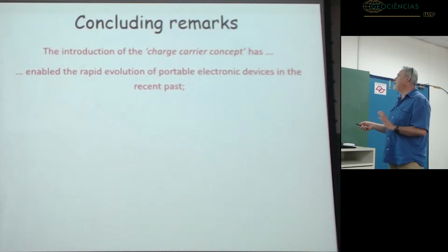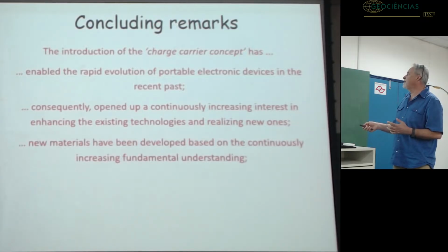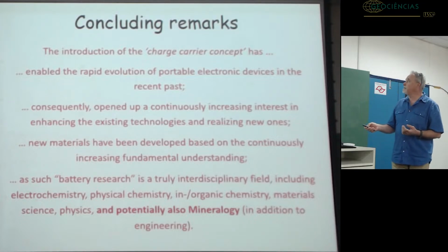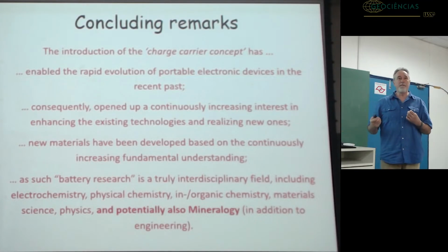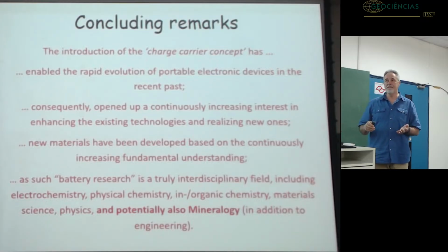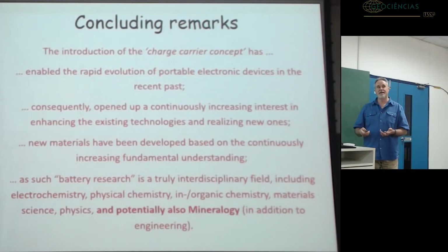Okay, concluding remarks. I wouldn't spend much time on what we saw in the battery research. But what I would say is that a dopant in any material, not only lithium-ion batteries, can affect the physical properties little, very little, or very much, considerably. So the localization of the dopant, and already the fact of whether it really entered the structure or created micro to nano inclusions, is important to know.